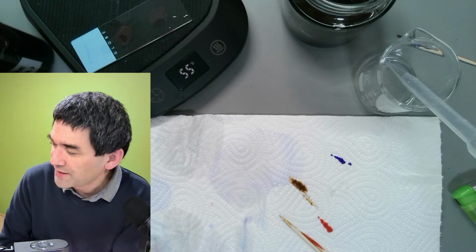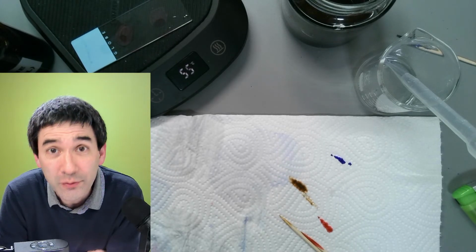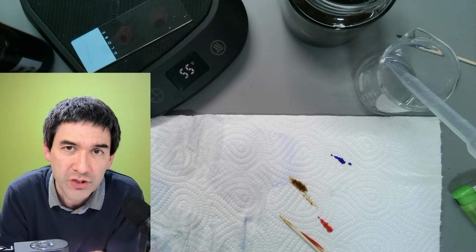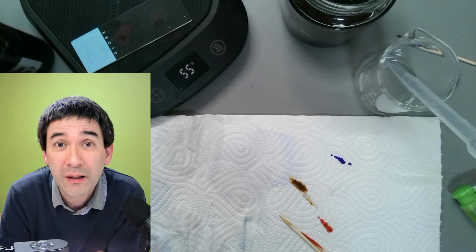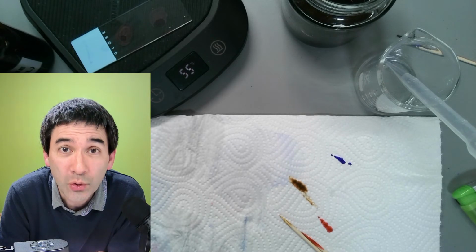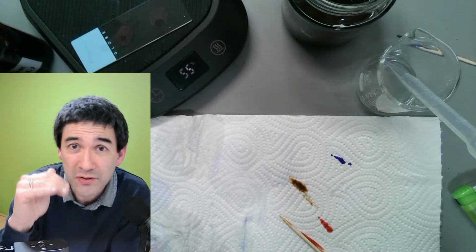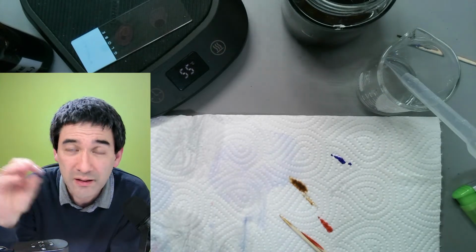My suggestion is, if you are interested in observing bacteria, don't grow them on petri dishes because of contaminants. Just go out and get yourself some yogurt, especially the liquid part, the watery thing that sometimes appears in yogurt.